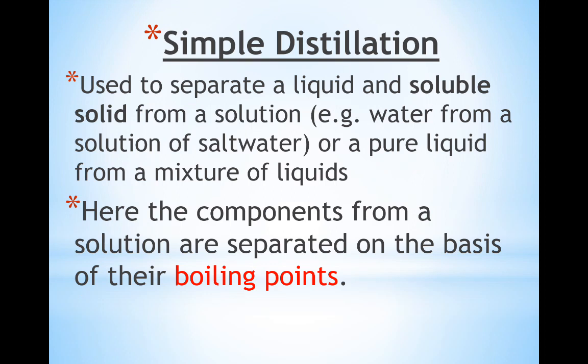Now, simple distillation is used to separate a liquid and a soluble solid from a solution. For example, water from a solution of salt water, or a pure liquid from a mixture of liquids. Here, the components of a solution are separated on the basis of their boiling points.